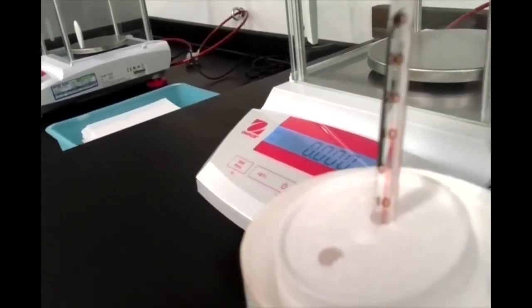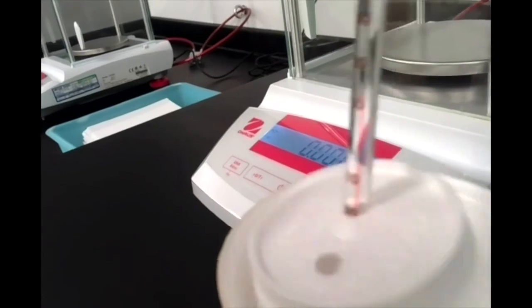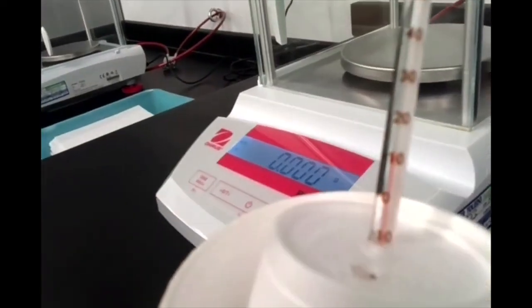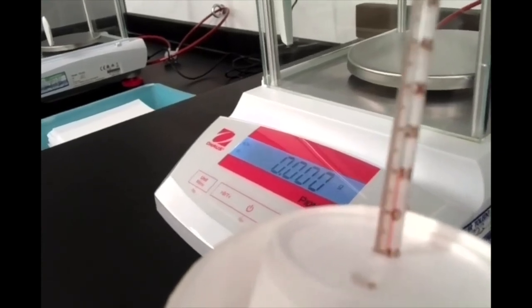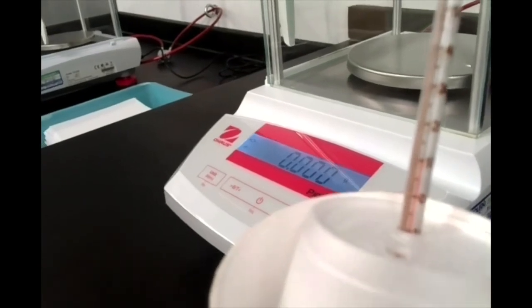Now, the thing to watch out for here is that if we get down to the temperature we want, we have to hope that all the ice is melted, but if it's not, we can do a quick transfer of the water to another container while we dump out any excess ice. The key thing is we don't want any ice in our beaker or in our styrofoam cup when we weigh this at the end of the lab.